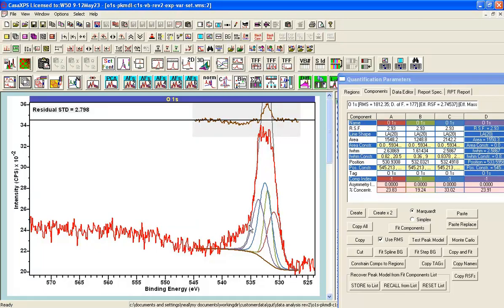We have to consider what this structure here is. If these are the four peaks that represent photoemission, what's going on with the remaining signal? It's unlikely that we've got an Oxygen 1S peak anywhere between 540 and 535 eV — that would require some sort of ionic bond to introduce such a large shift. Covalent bonds tend to cluster, as commonly seen in polymers.